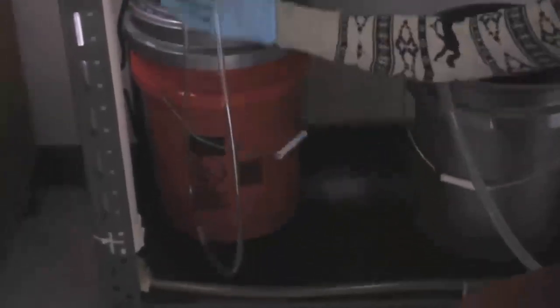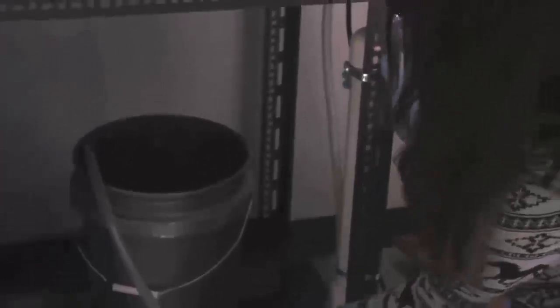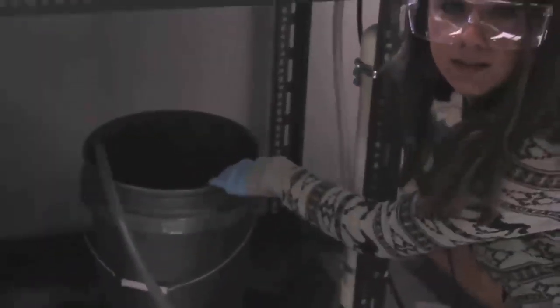This is our first filter filled with a resin, which extracts impurities from the biodiesel. Once it goes through this filter, it's pumped over to the second filter, which extracts a different type of impurity. And once it comes off there, it washes into our wash bucket, which is our final product.